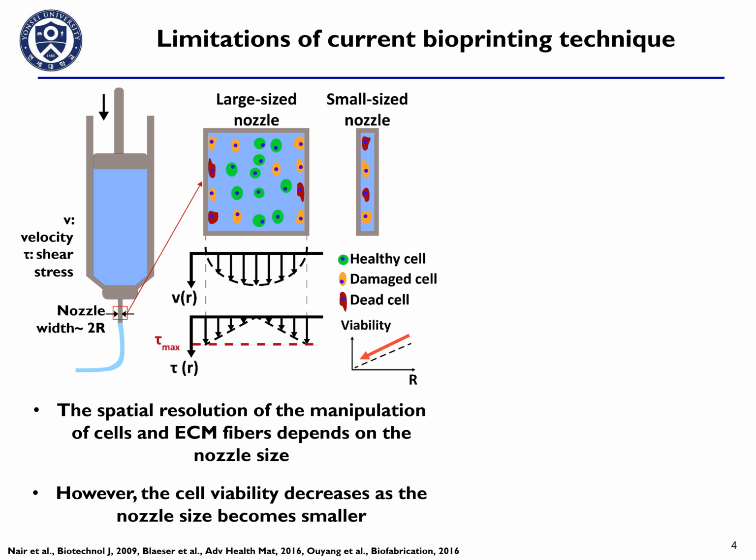However, bioprinting technique has some technical issues. Spatial resolution for the bioprinting depends on the nozzle size. However, reducing the nozzle size can cause a higher shear stress on cells and cause cellular damage or cellular death.